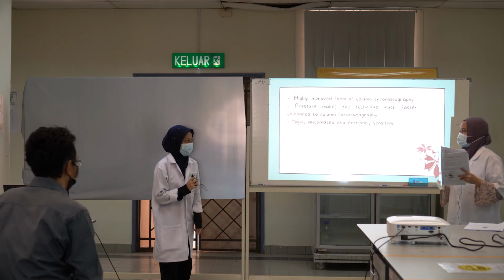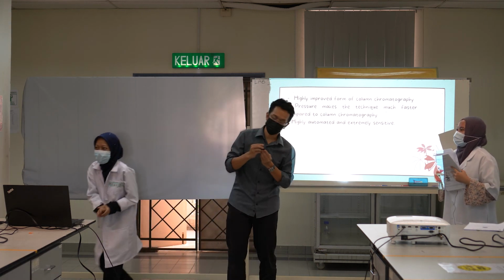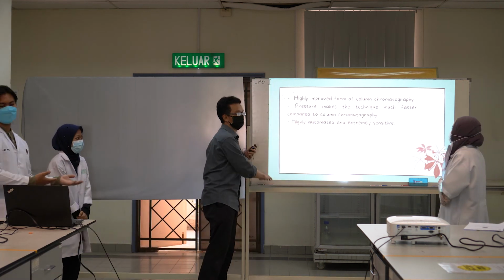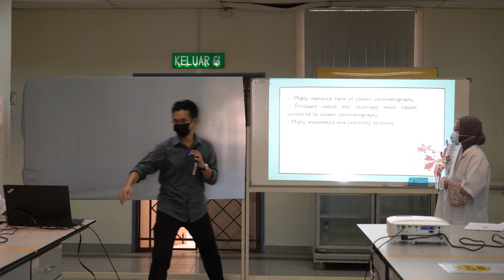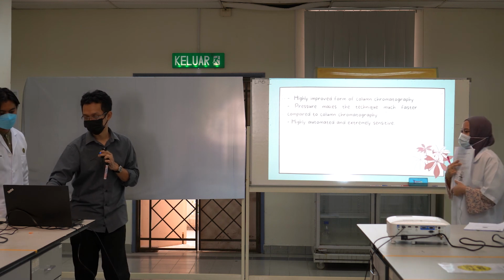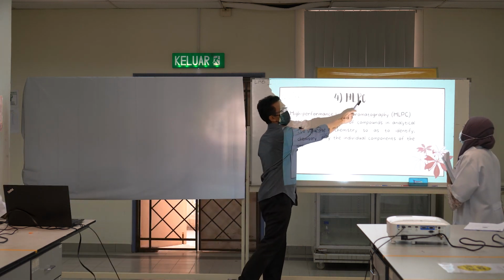Okay. Thank you. Let me add a little bit about this. First, the name is actually not HLPC, it's HPLC, because it is high performance liquid chromatography.